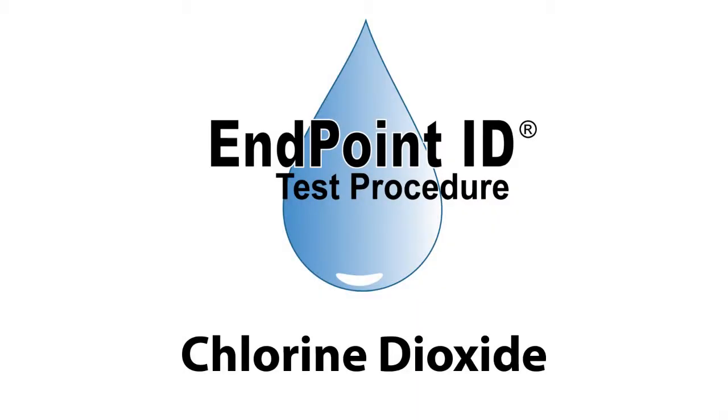This is a demonstration of a Chlorine Dioxide Drop Count Test Kit using EndpointID procedures.